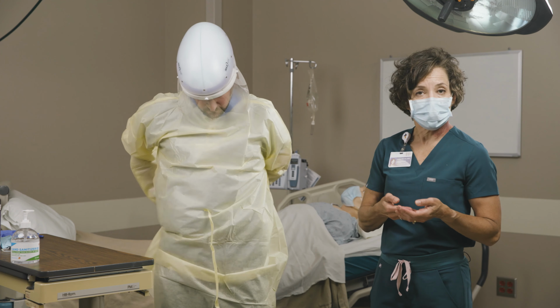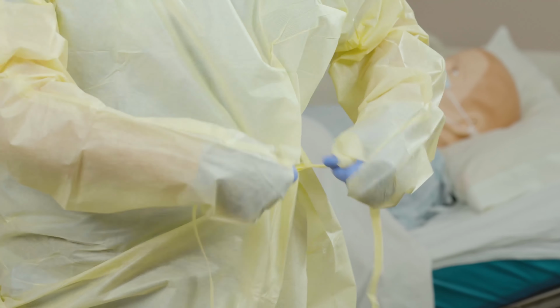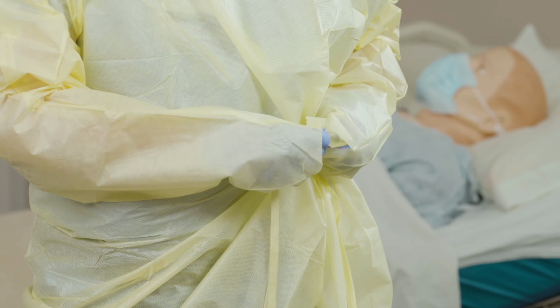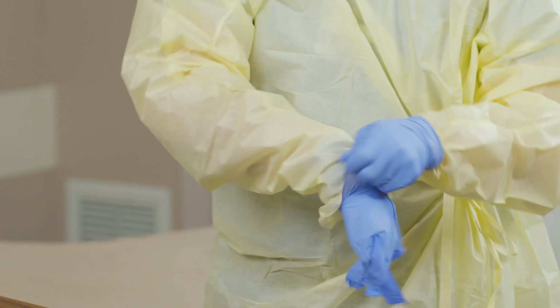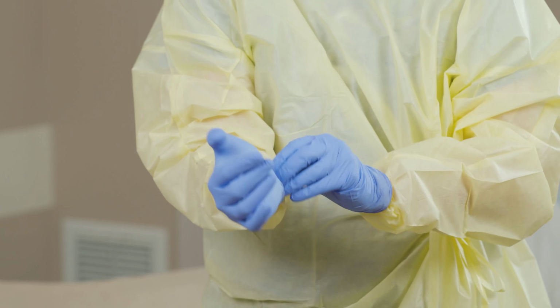And as we discussed before, we're going to make sure and secure all ties on the gown, tying them in a bow to make that doffing process easier. And then he's going to finish by putting his second pair of gloves on over the cuff of the gown. And then he's ready to go into the patient room.